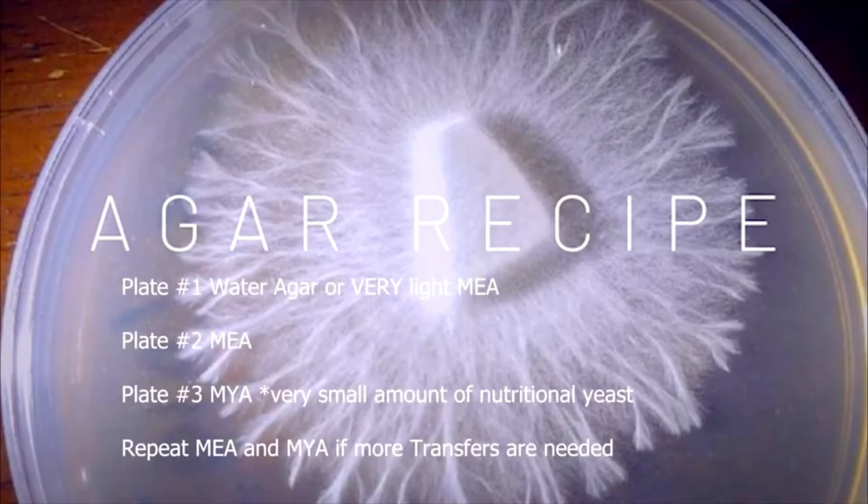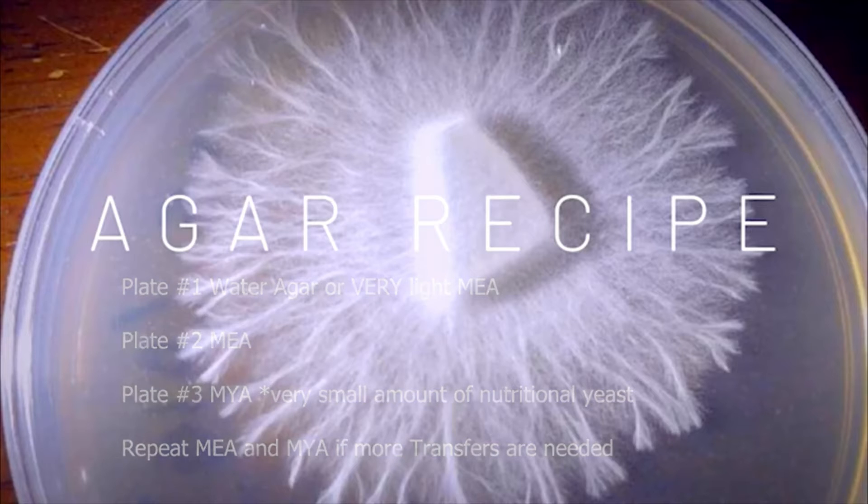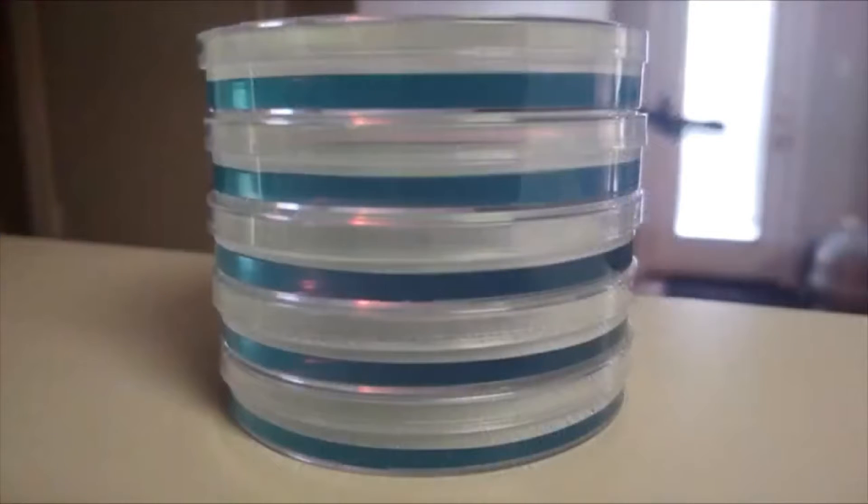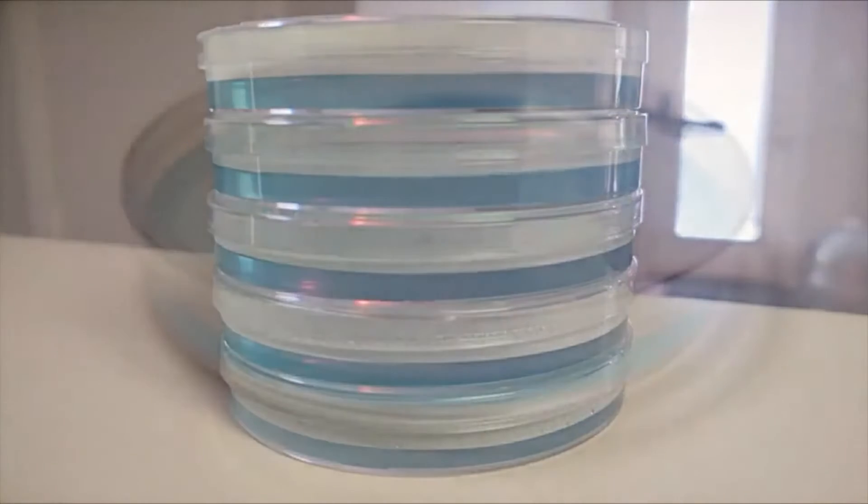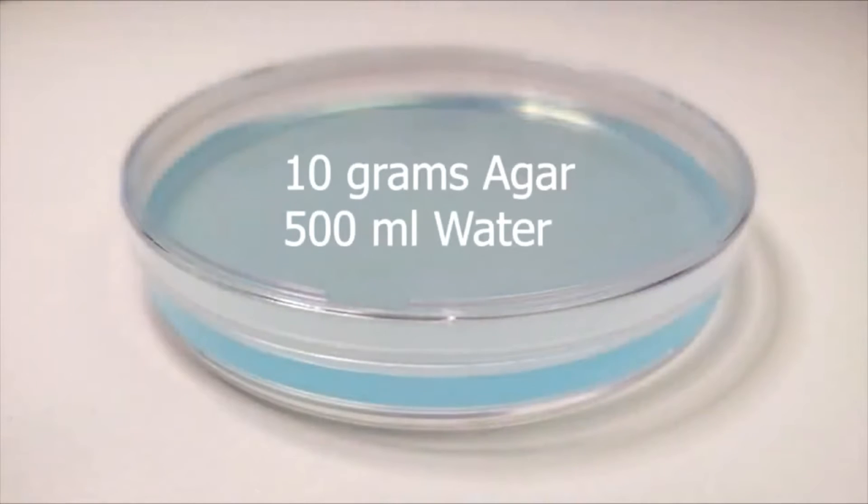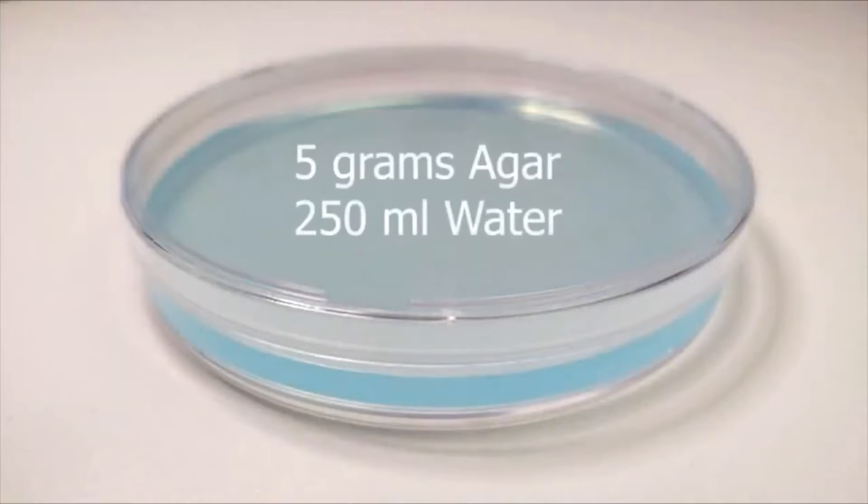As you research, you find that rhizomorphic and tomentose will both produce beautiful mushrooms, but it's easier to determine the most viable points to make successful transfers due to the antlering and rhizomorphic growth. Our water agar recipe is simply 10 grams of agar to 500 milliliters of purified boiling water.